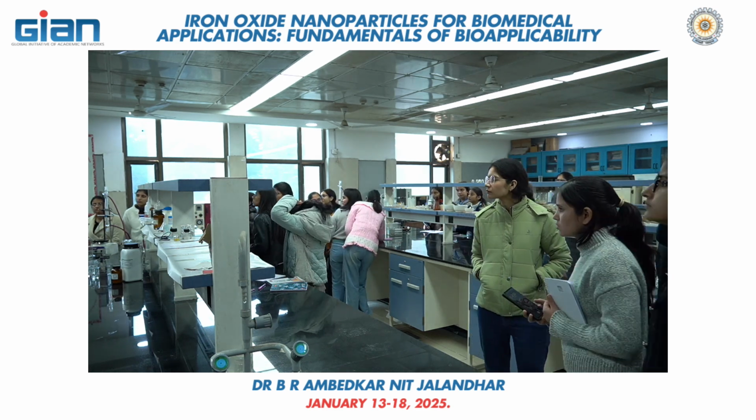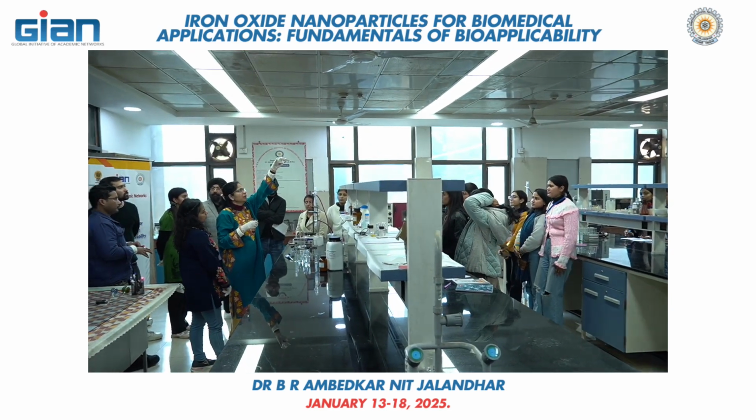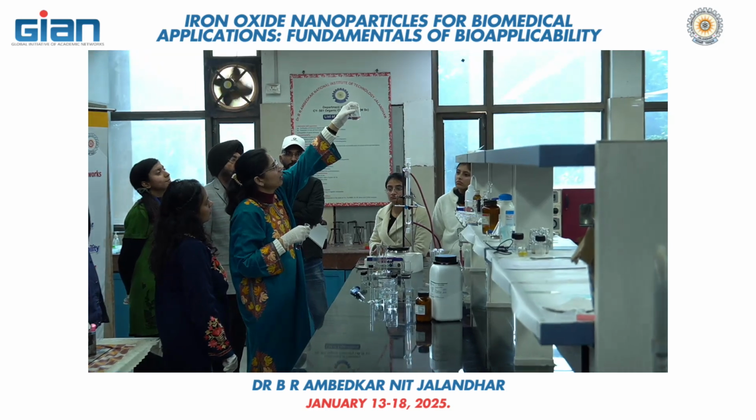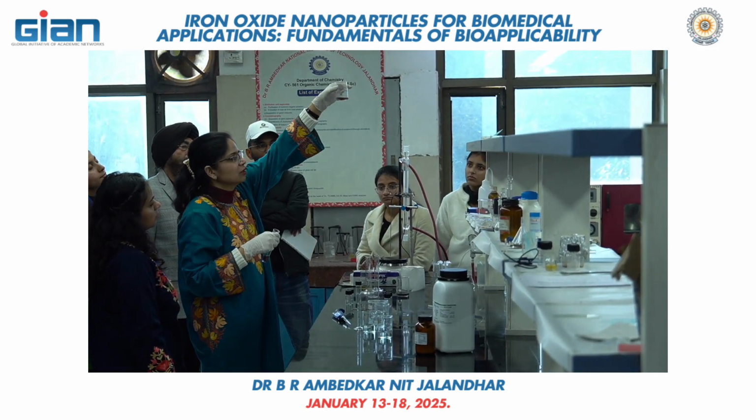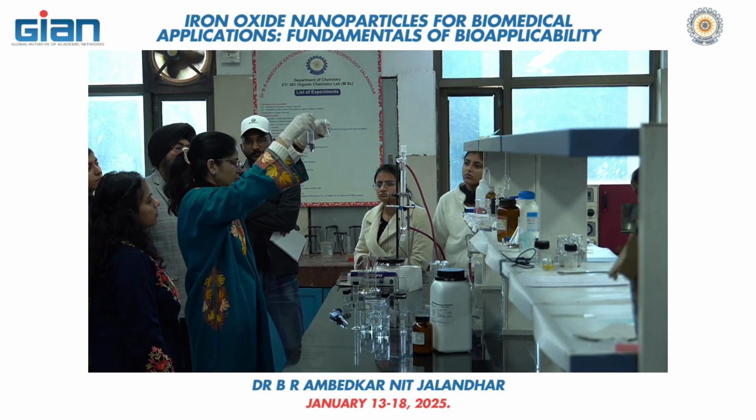Now you can see this one is ruby red because the concentration of the surfactant was a little bit more, so I have diluted it now. So this one is ruby red and this one is bluish.